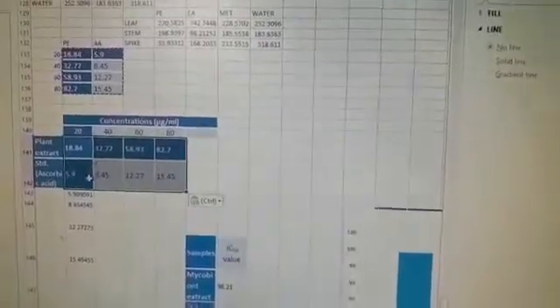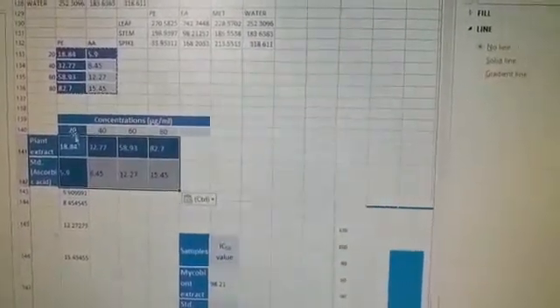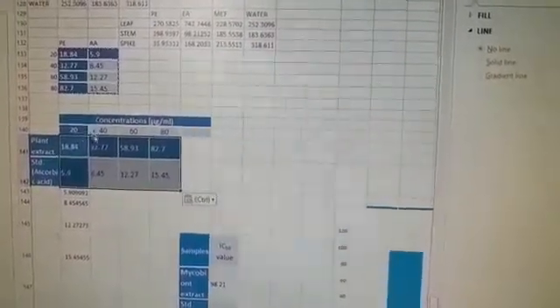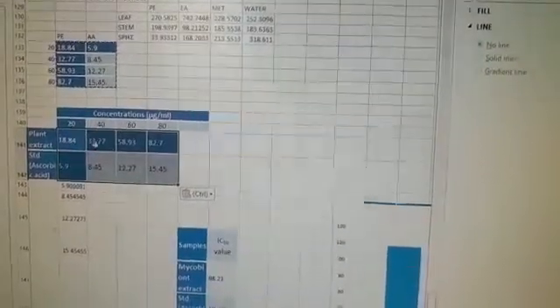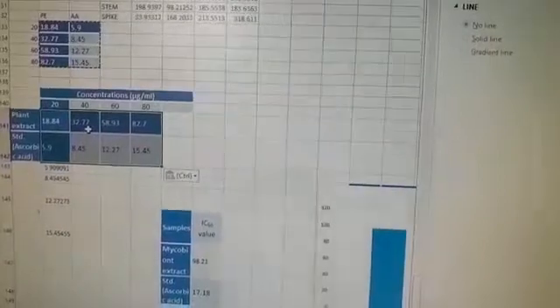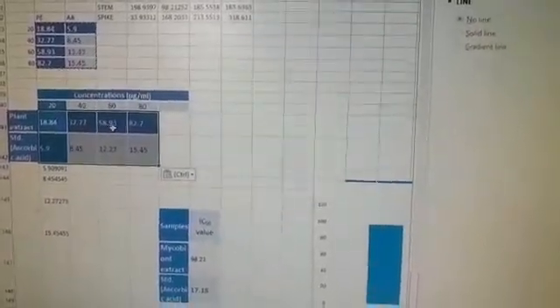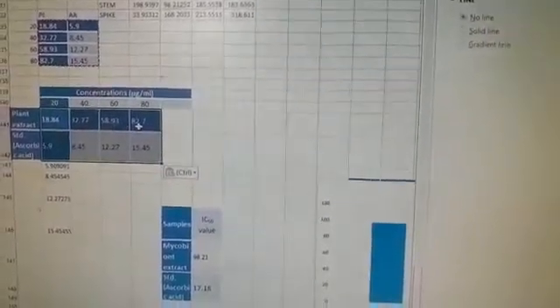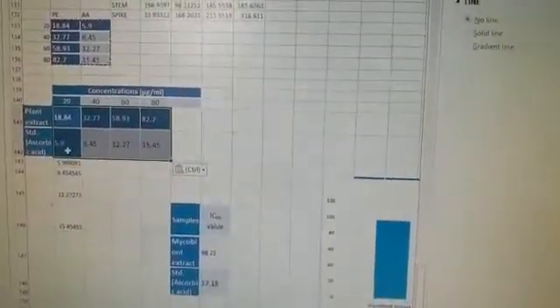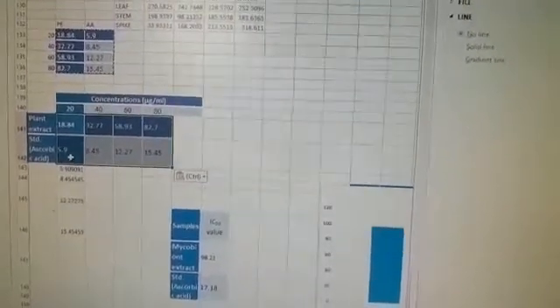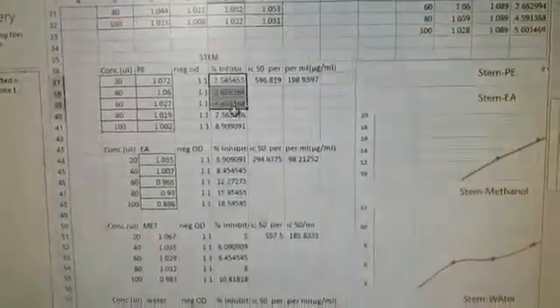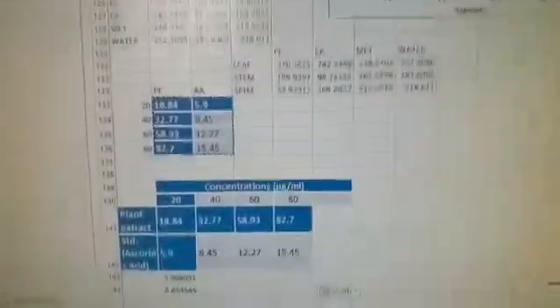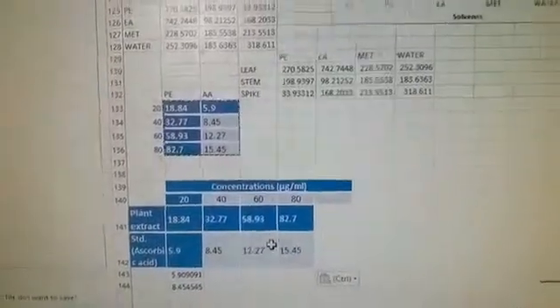We have pasted 20, 40, 60 - the concentration values. These are 20 microliter, 40 microliter, 60 microliter with 18.84, 32.7, 58.93 percent inhibition. Similarly, here are the ascorbic acid percentage of inhibition values. Please bring those values and paste them here.